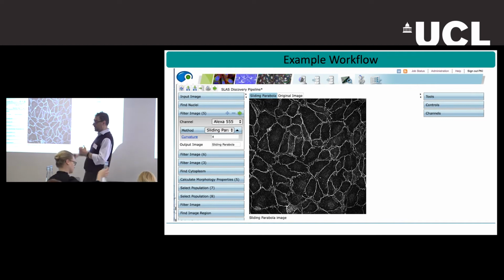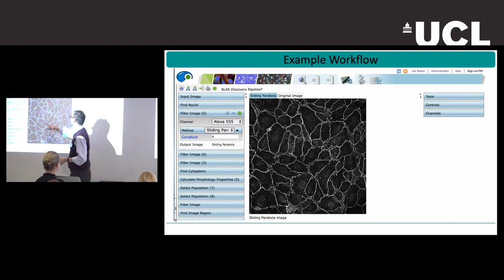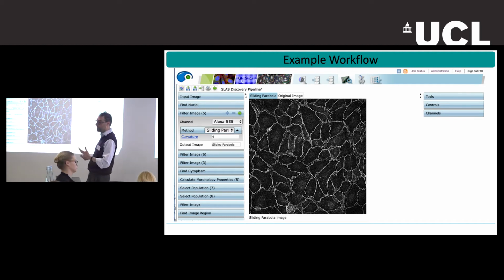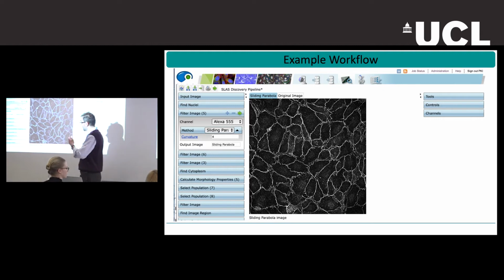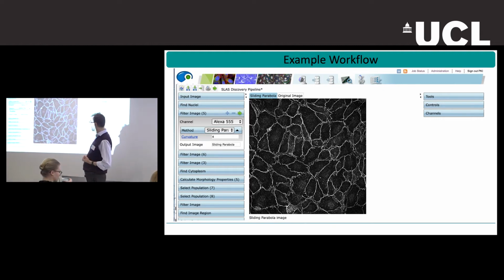And now, since it's attached to a very powerful computer, they recognize automatically what they are seeing. Even if there are small discontinuities in the image, the computer will easily make mistakes in recognizing what is a cell and what is not. So one of the things we are trying to do is teach the computer what we can do quite easily and natively. So, find the cell.